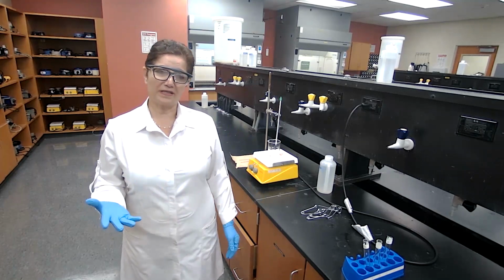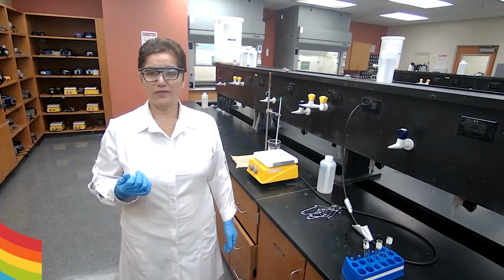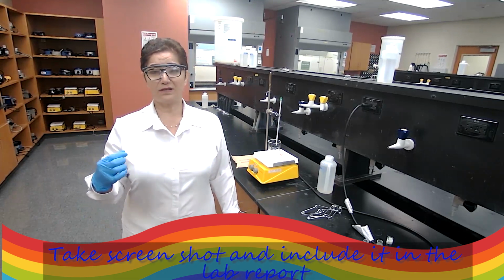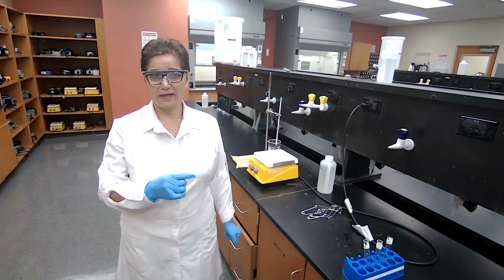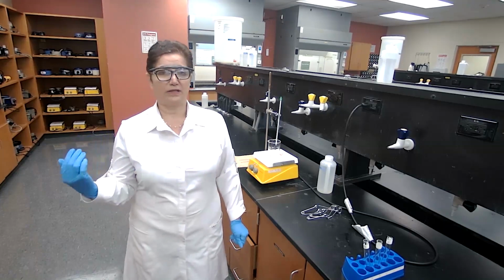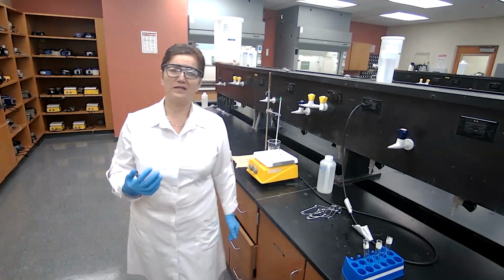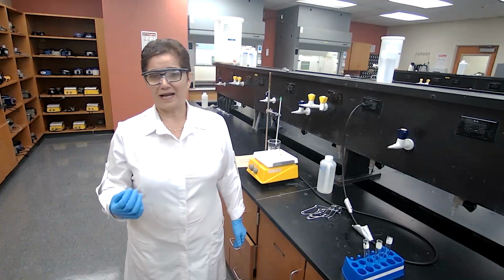In part 2 of the experiment, I'm using 1 alcohol, which is butanol, and I'm going to mix it with 3 unknown acids. Based on the odor, you need to identify which acids were combined with the butanol, or 1-butanol, to prepare the esters. Esterification, or specifically Fischer esterification, is a reaction between a carboxylic acid and an alcohol.